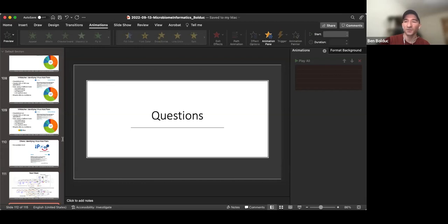I don't think the resources are as developed as iVirus and KBase in terms of being able to process larger scale data sets and organize them. I also have some issues with the Galaxy interface. And from a developer perspective, I find it a little bit more challenging in a way to use Galaxy.